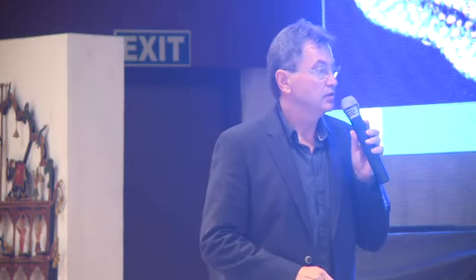You are getting, via automated segmentation and tracking of these structures, because they're highly mobile, which is another challenge, hundreds of such recovery curves, typically for FRAP experiments, and therefore also distributions of recoveries and kinetics. This allows us to combine this with modeling and population analysis in order to get enhanced statistical analysis. Typically, we can easily analyze around 200 ER-exit sites per hour with this technology.